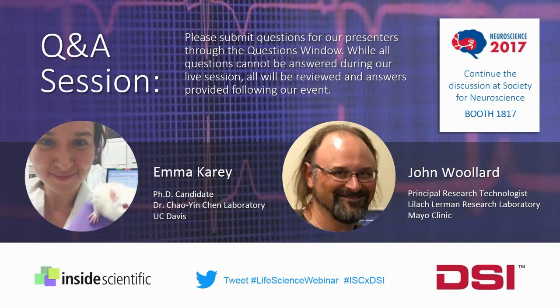Next question. So you both presented HRV data, one derived from ECG traces, the other from blood pressure recordings. Santiago has asked how comparable are results obtained from ECG versus blood pressure data. So perhaps we could have a discussion about your experience, ECG versus blood pressure, and the experimental advantages or drawbacks of using these measurements to interpret changes in autonomic function. Again, Emma, maybe you could lead us off.